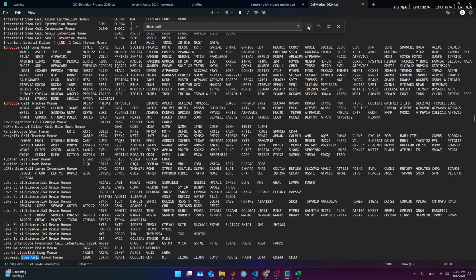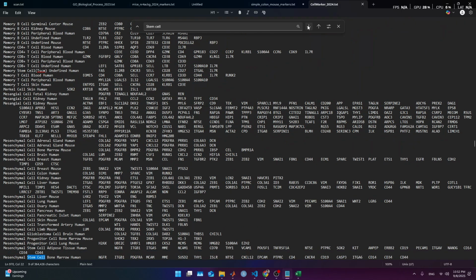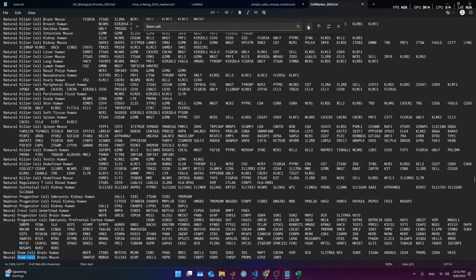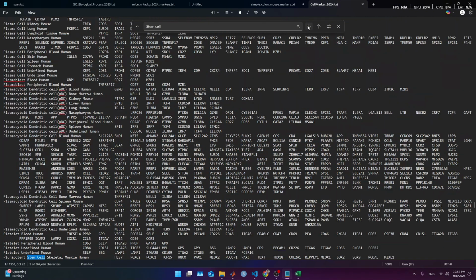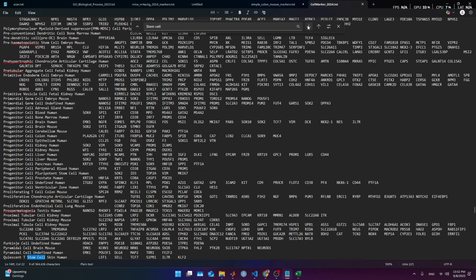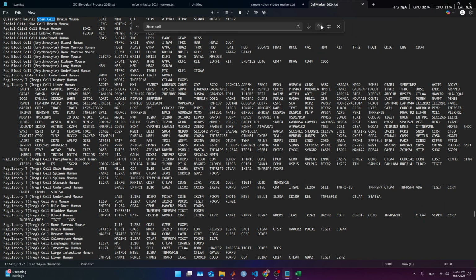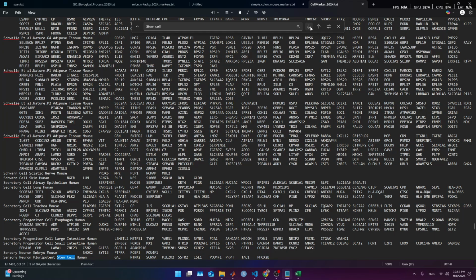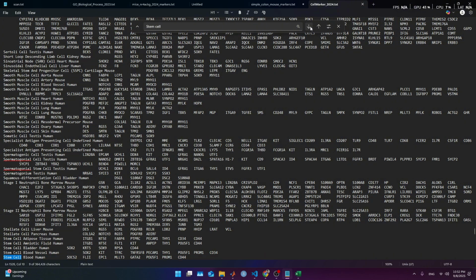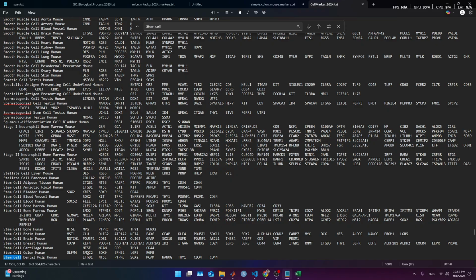Let's keep looking for leukemia, memory stem cells, and neural stem cell, pluripotent stem cell. Basically, whatever it brings colon and a stem cell, we can utilize. But most of the time, we gotta be careful how we curate this data. In an adipocyte, no, none of this. Brain, colon, human. Here's again.